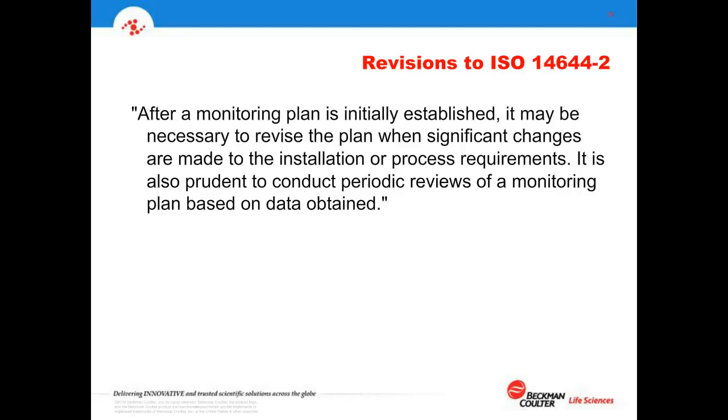There is also the counsel to go back and review a plan. So there should be some kind of review on a periodic basis, maybe once a year, maybe every 2 years, to look at the plan that you've put forward and assess, is it still appropriate? Do I need more? Do I have more people in the room and I need to change my limits? Do I have fewer people? Have I added a new process? Those things should be considered in monitoring.